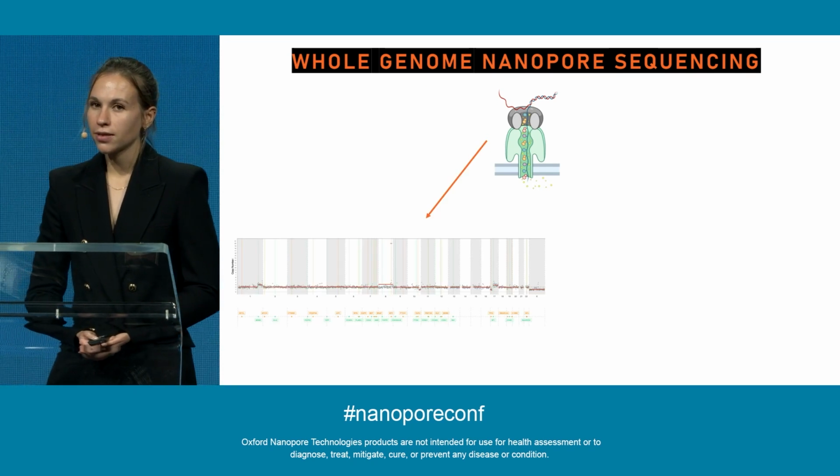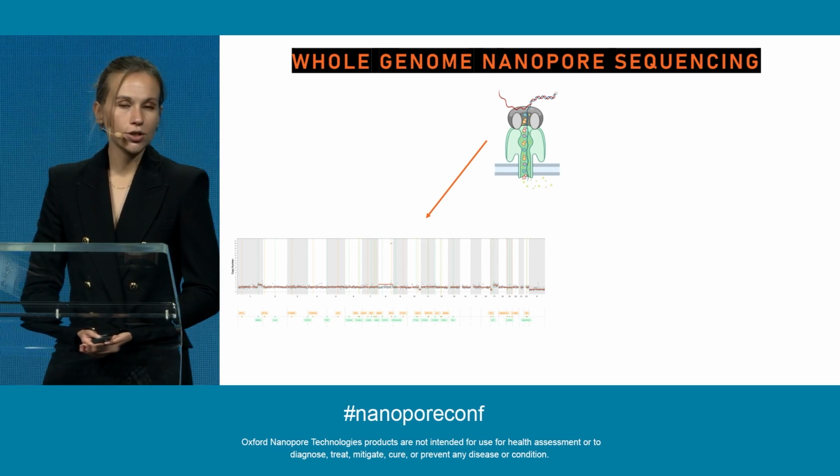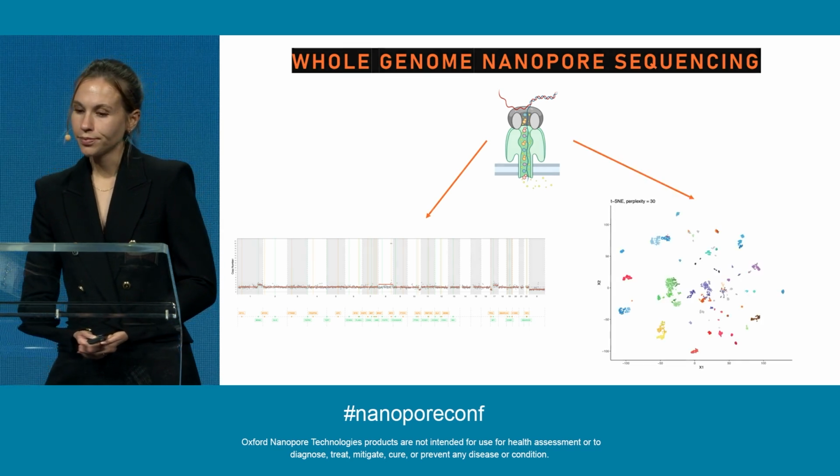And as you can see here on this example, it allows us to detect the amplifications of interest, notably in the MYC gene for the medulloblastomas. And also, of course, we wanted to obtain the methylation profile.